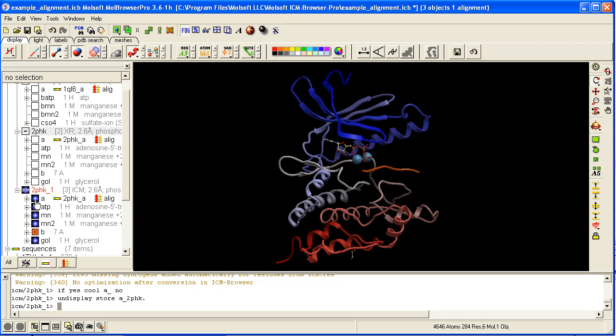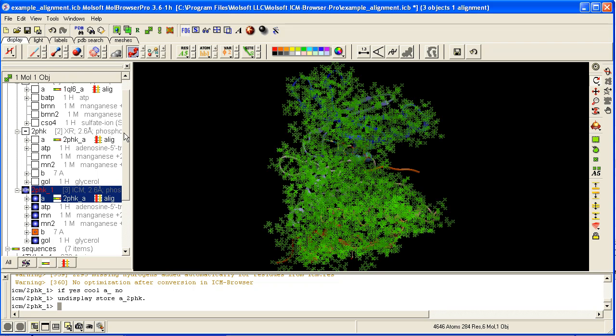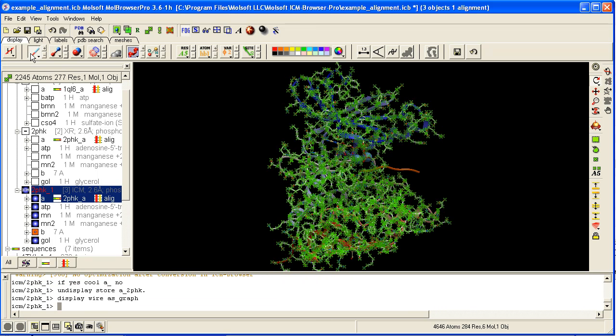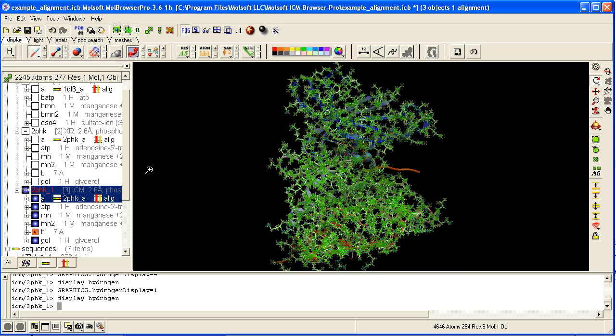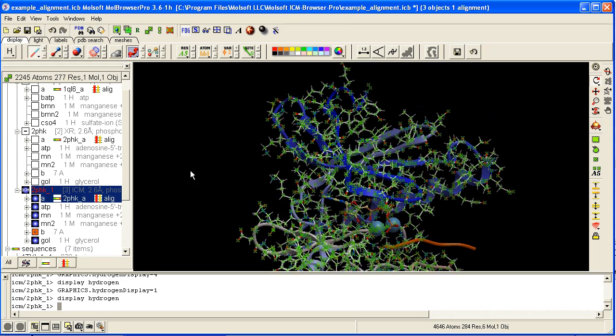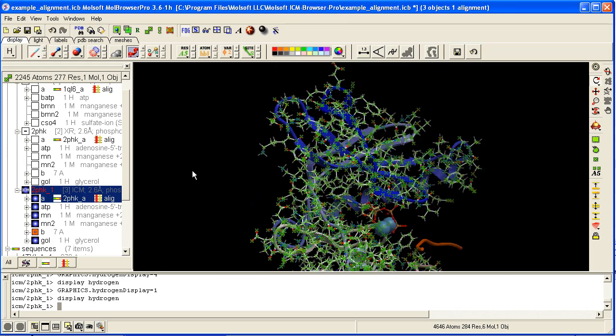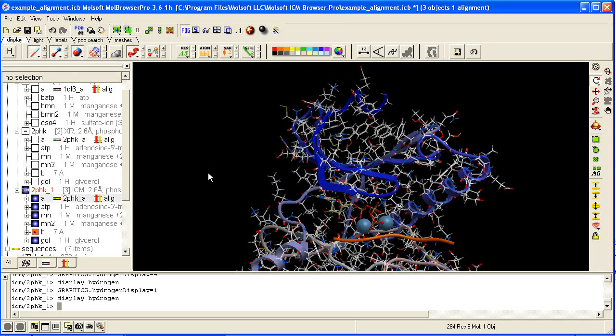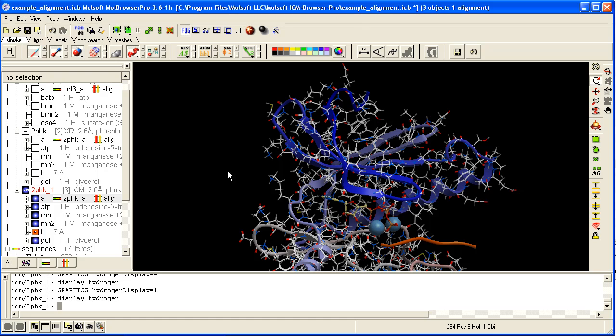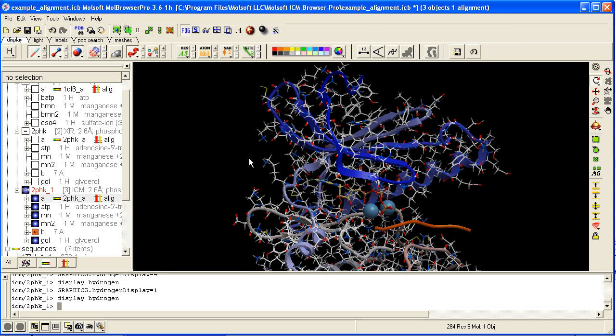It will have hydrogen atoms added and optimized, as well as any missing atoms in the side chains added according to the residue library.